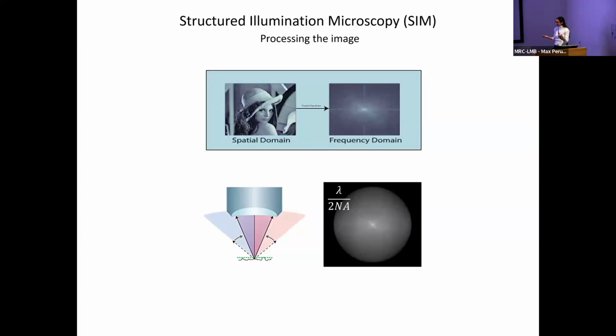Now, if, for example, you use ImageJ and you want to do a line plot, I take one line of this image, I do a line plot, and I end up with an intensity profile. And for example, for one line, I can say my intensity goes up and down. So I transform this image from a series of pixels into a graph. But I'm describing still the same data. And so what the Fourier transform does is transform an image, a series of pixels, into a series of frequencies. So it's just a different way to describe the same image.